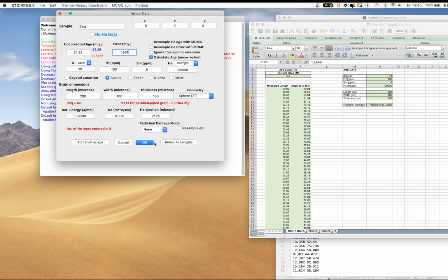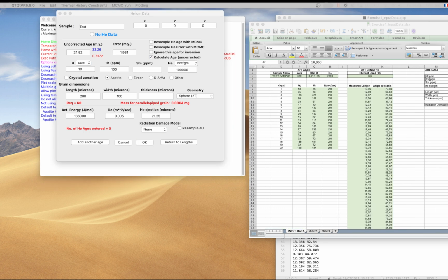Okay. And I'm just going to pause there. Okay. One thing you notice once I've put in the data, we've calculated the age. I'll just say this.